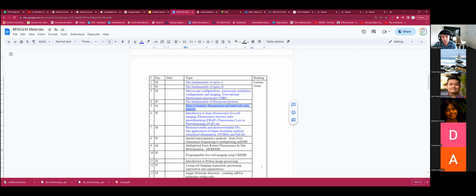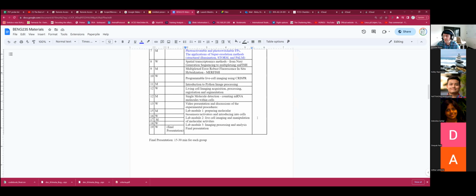Another thing that could be potentially useful for you, Debalina, would be something like single molecule FISH, which is now getting increasingly easy to get access to. By that I mean you have a sample and you're manipulating in some way the RNA within the cells. You might want to know exactly what's happening to that RNA and count it relatively fast with very high resolution, so very accurately. That is exactly what I'm looking for. Right. So for that, this course will teach you experimentally how to do single molecule FISH, such that you'll be able to quantify that particular RNA that you want to work on.